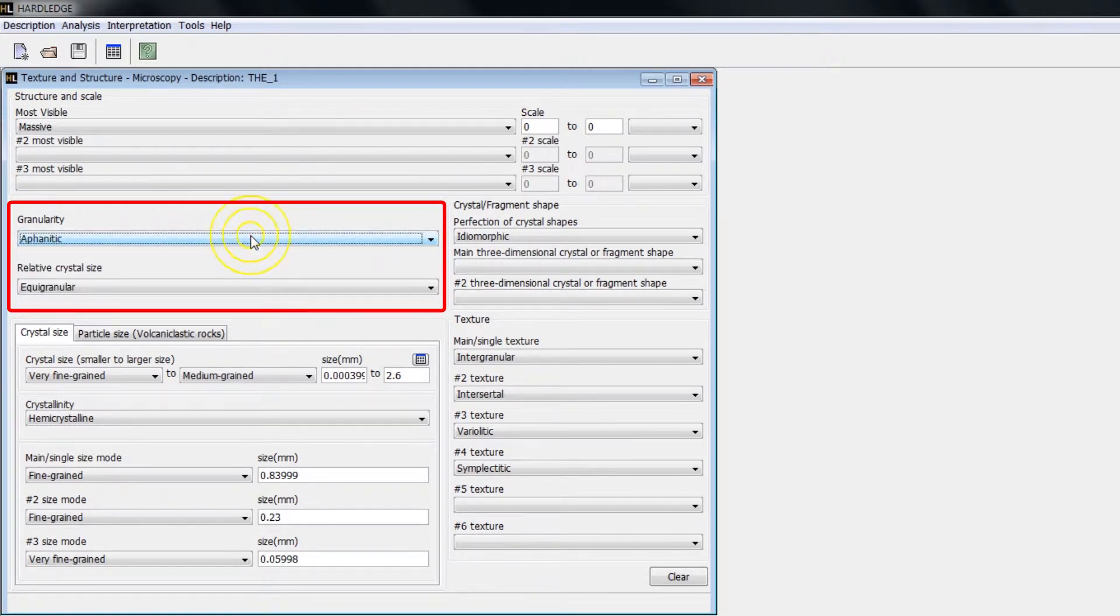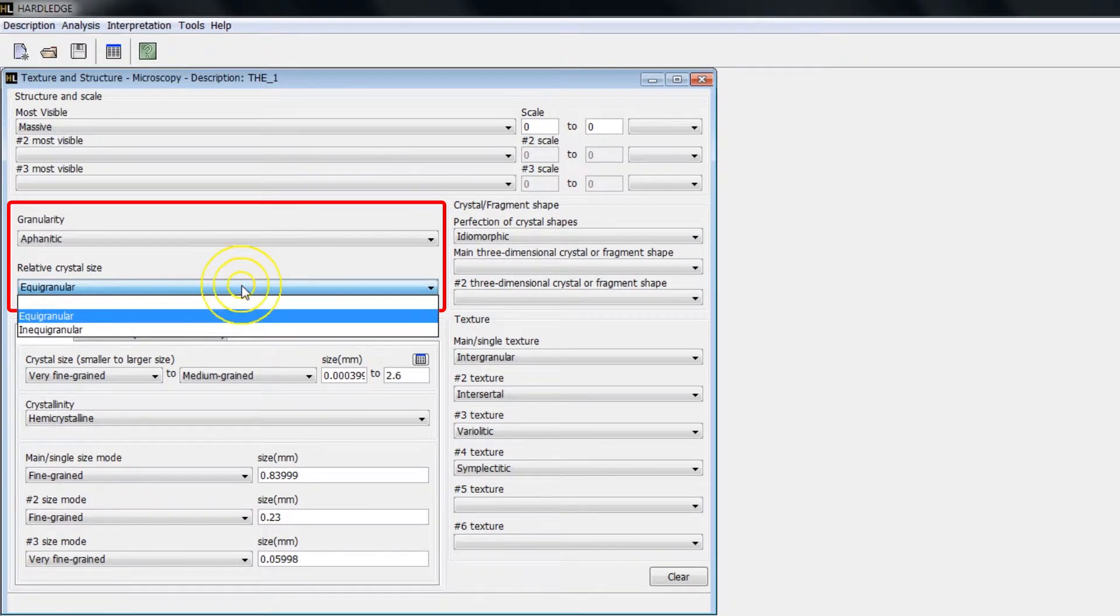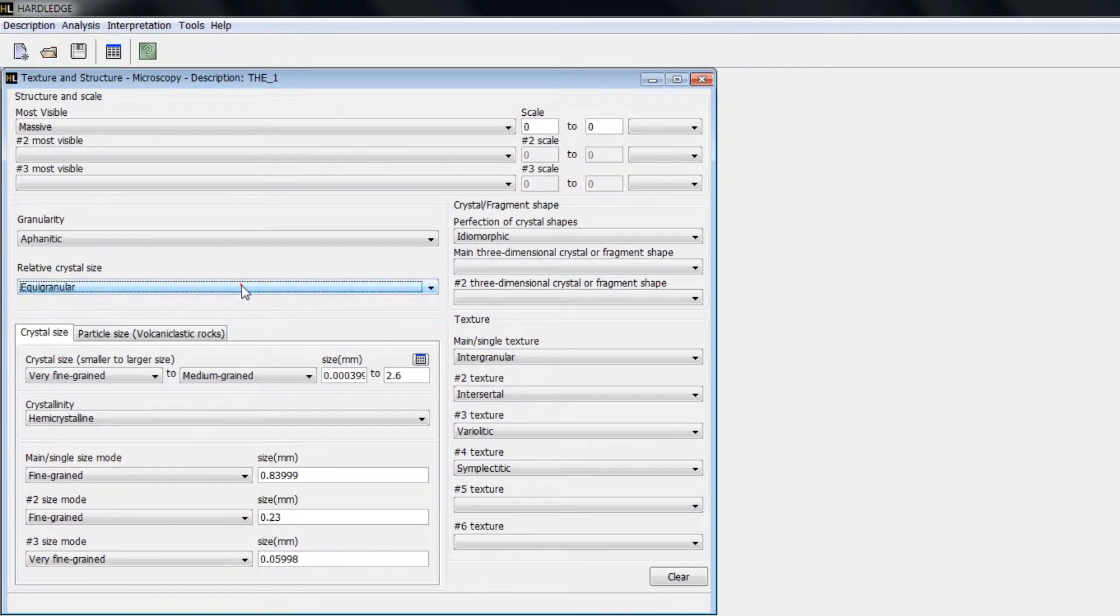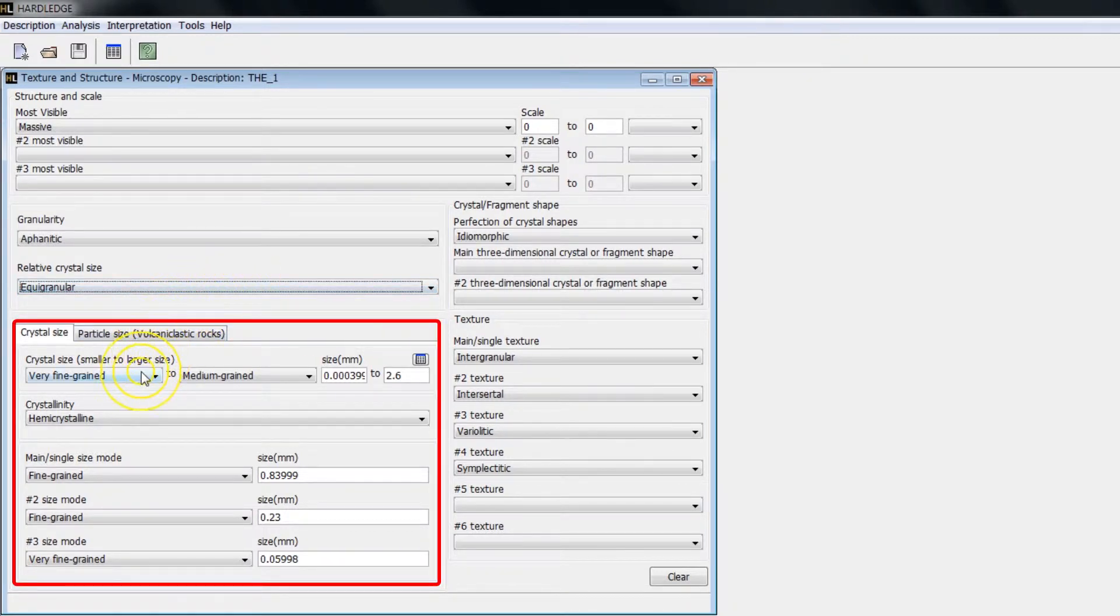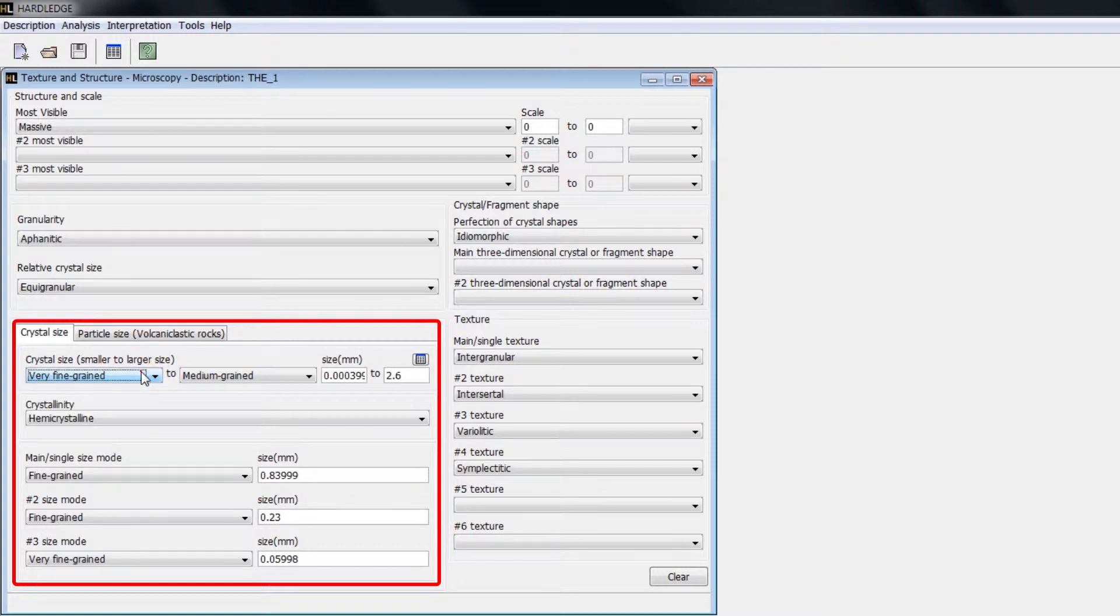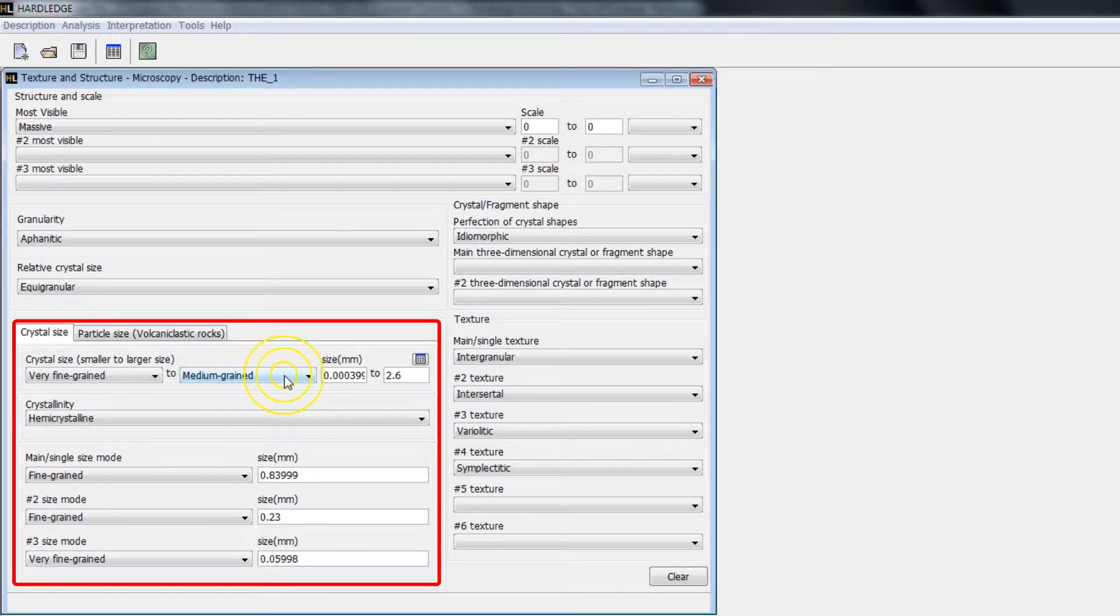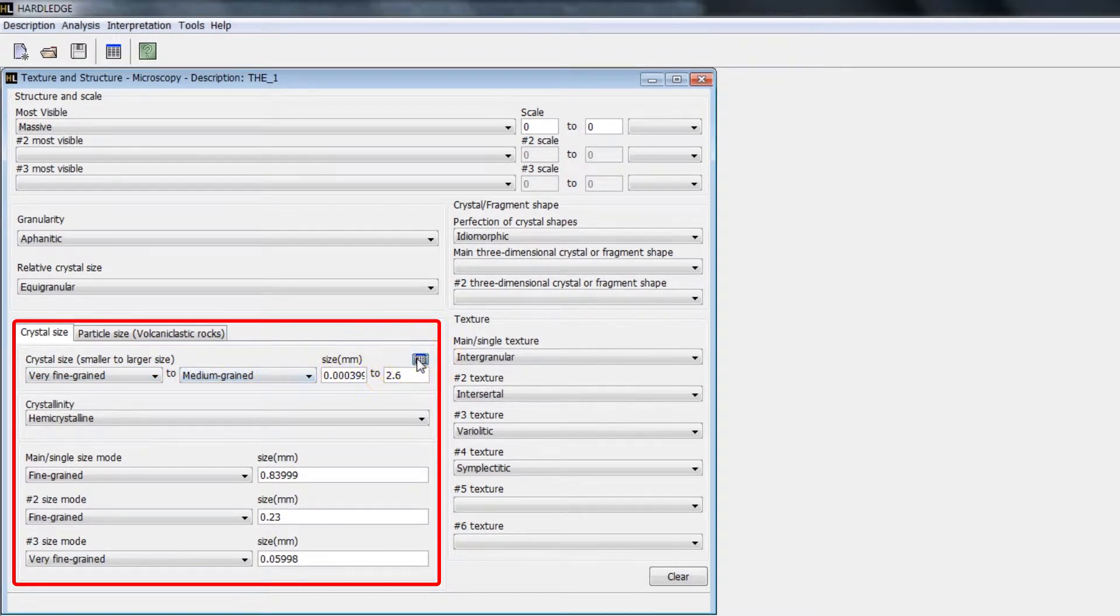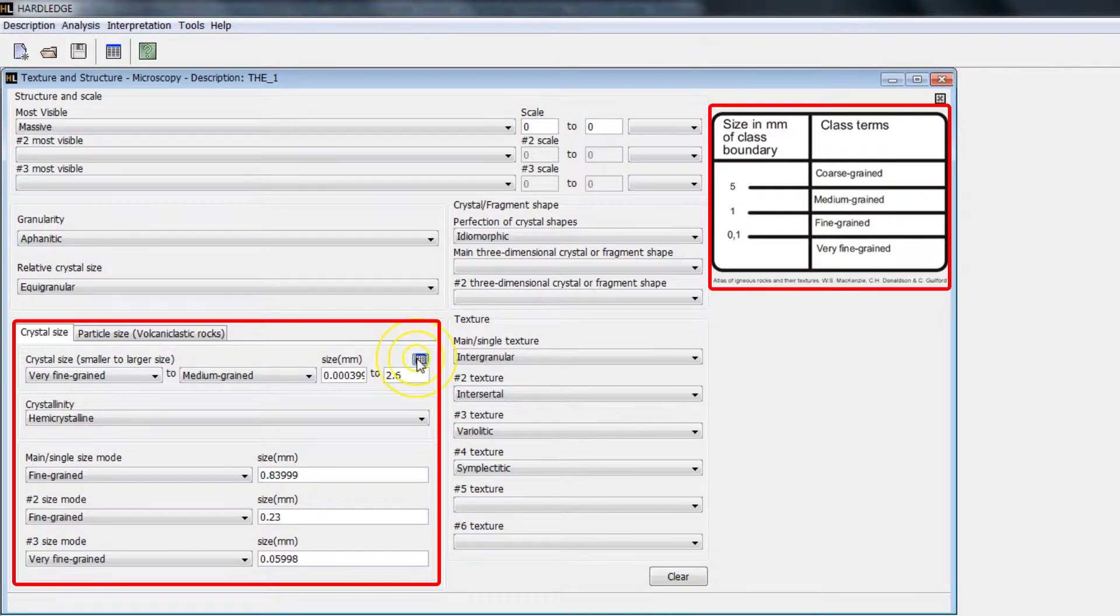In Relative Crystal Size, click on the desired option. In Crystal Size, click on the list of sizes, select the desired size, and type the dimensions. Clicking on the tablet icon, a table of crystal scales is shown.